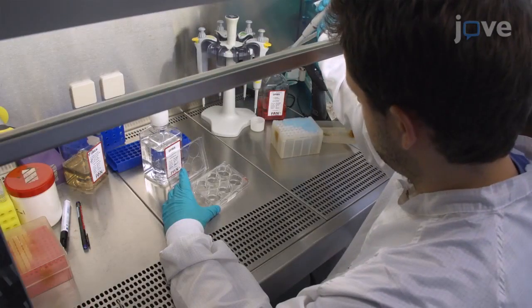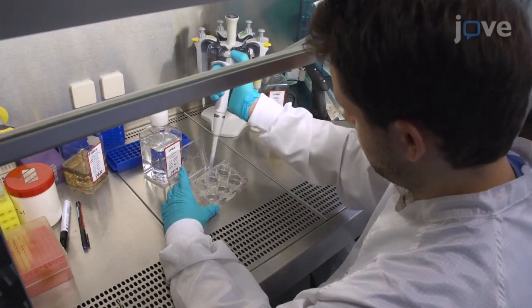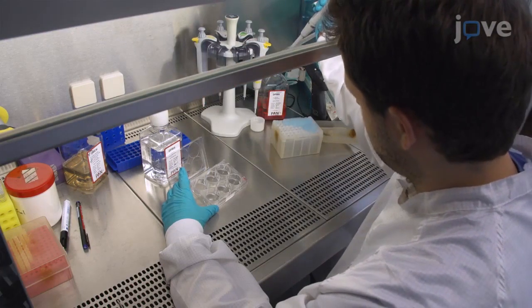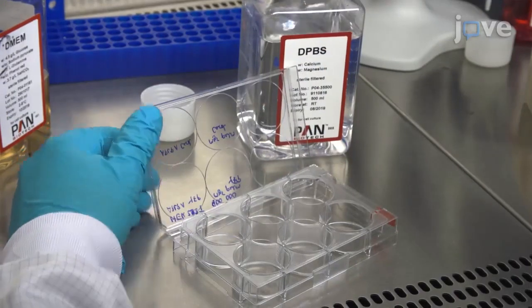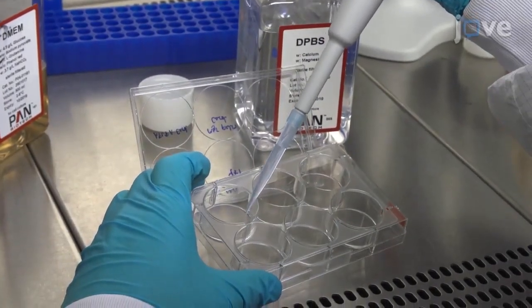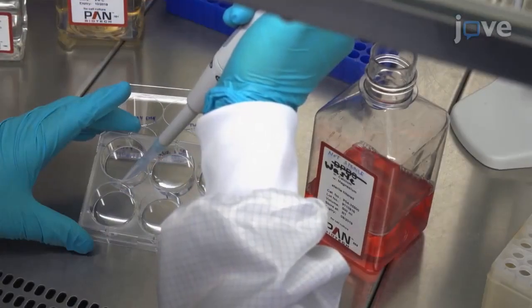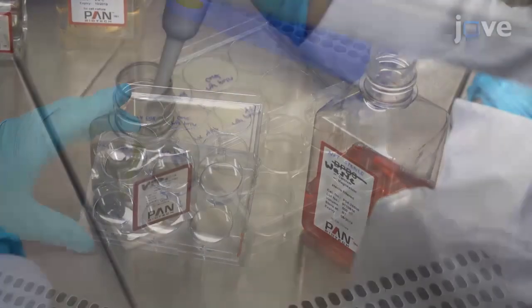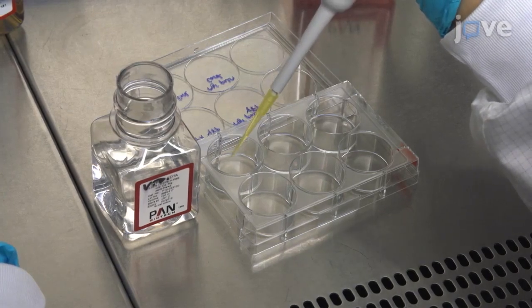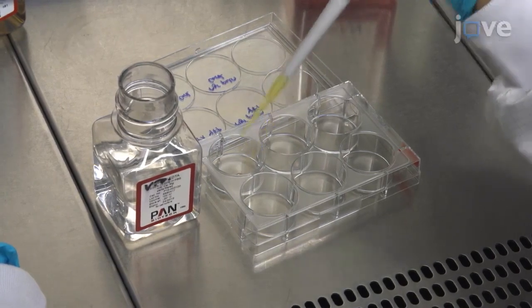After 4 hours, remove the growth medium and wash each well gently with 1 mL of PBS supplemented with magnesium and calcium, dropping PBS on the well edge to prevent detachment of the cells during washing. Then remove the PBS.